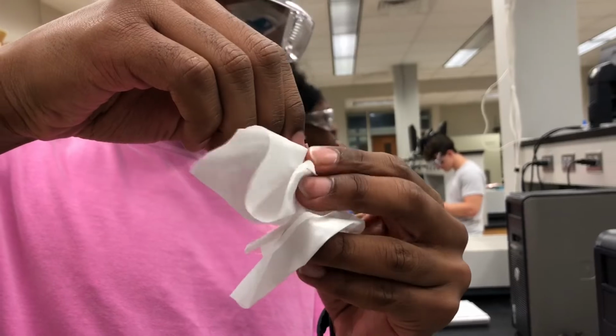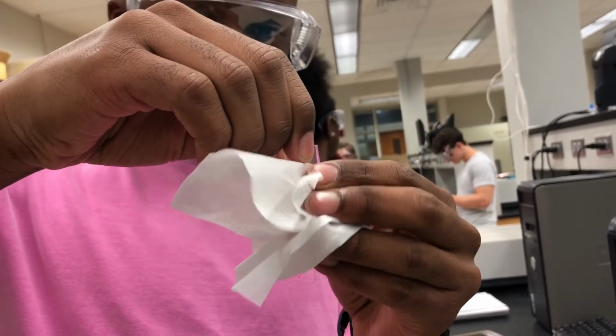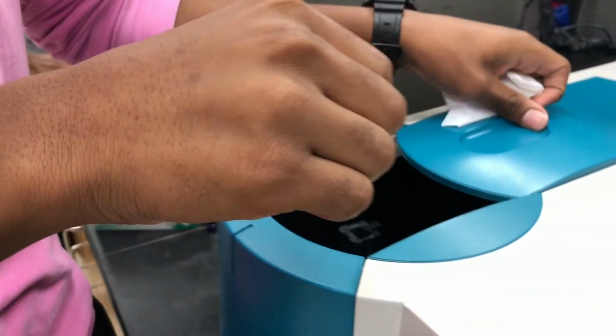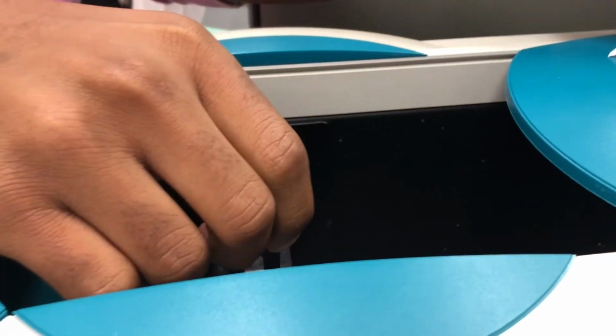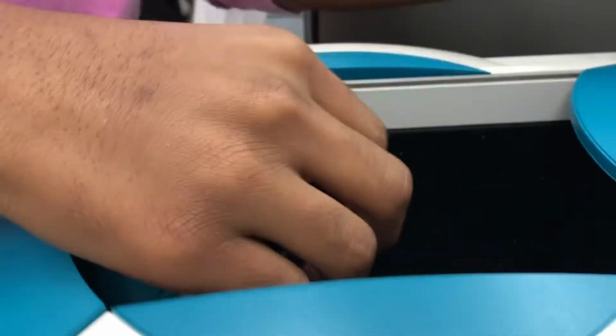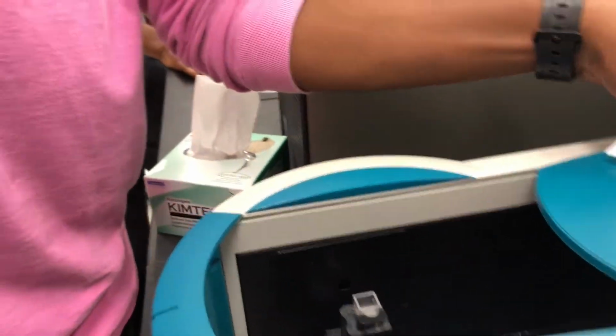Now, using the lab tissues, clean off the sides of the cuvette containing the blank that the light will pass through. Then, close the lid of the spectrophotometer and click 0. When you zero the spectrophotometer with the blank cuvette, you are eliminating the values for light absorbed by the cuvette in addition to its contents.